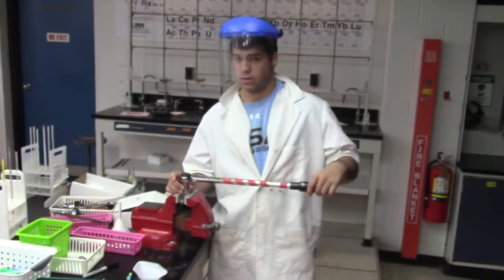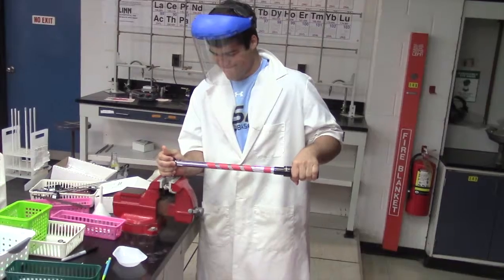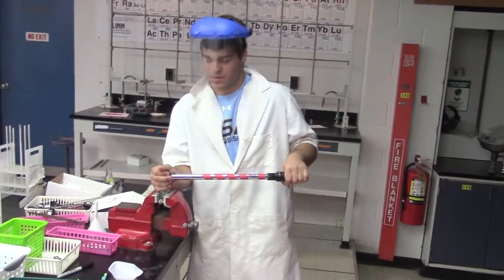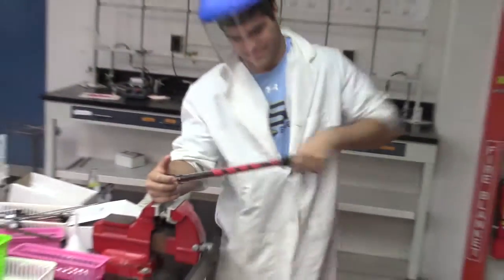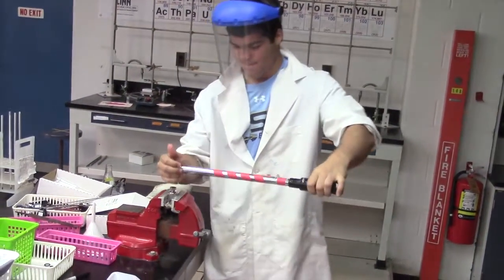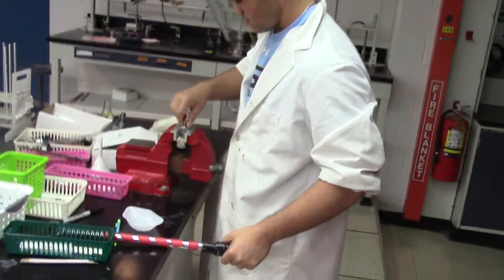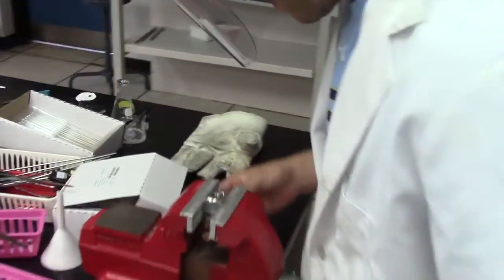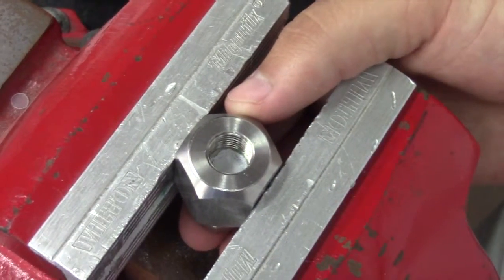And after about a minute, you're going to want to take off the top. Not easy. And then you got your salt plate. And you remove it from the clamp. All right.